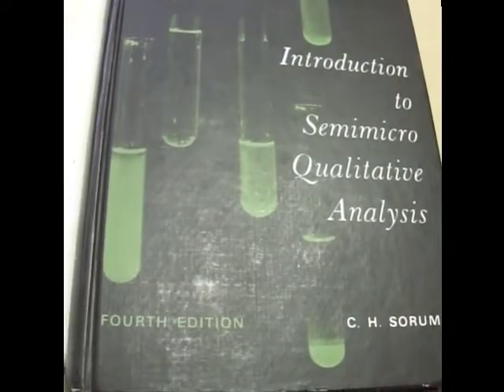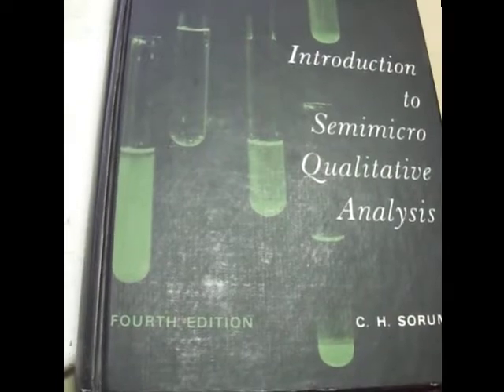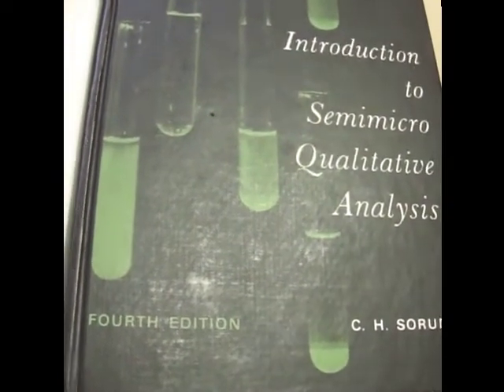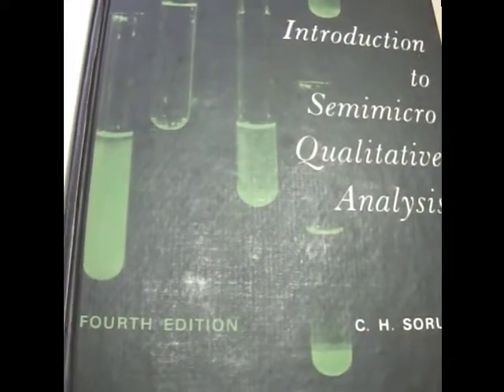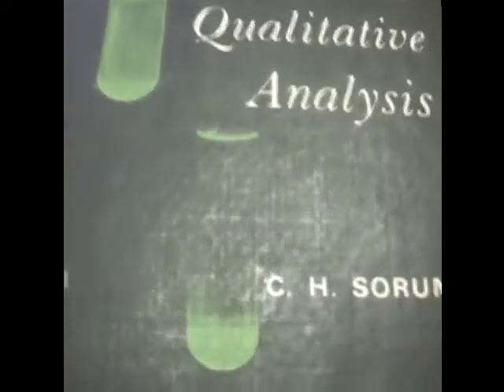Since this was described to me as a simple salt, I'm going to use this reference for the analysis. It's a semi-micro qualitative analysis book, and I'm using it because it's pretty much the only one I have, but it does seem to be a pretty good reference. It's by C.H. Sorum as the author.